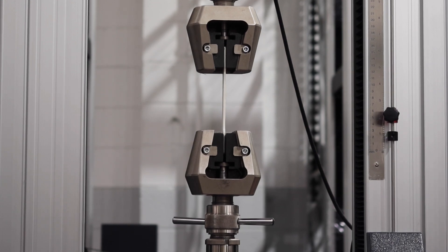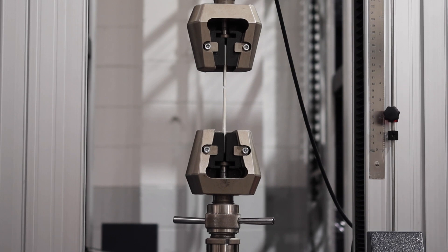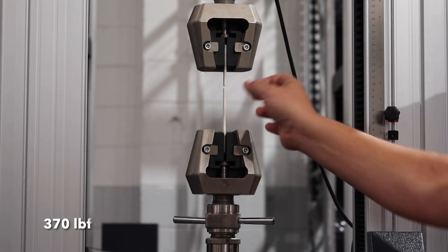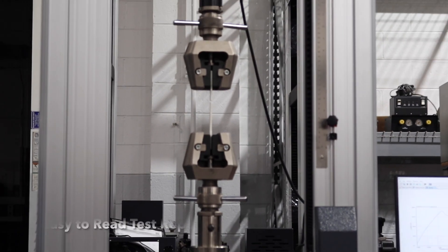And there it's yielding, elongating, we're now deforming, and it broke. The specimen reached 370 pounds. We have our single-page PDF report.